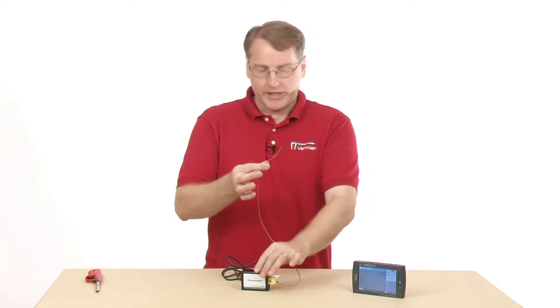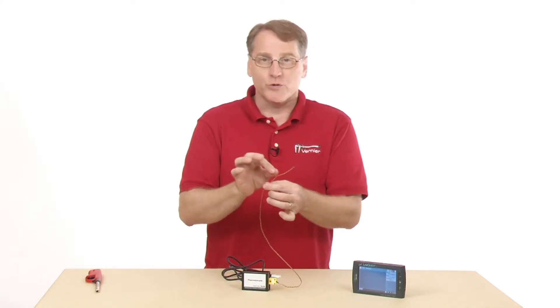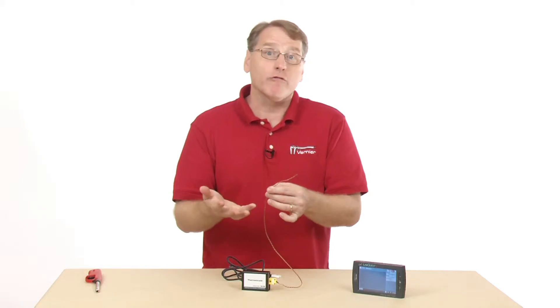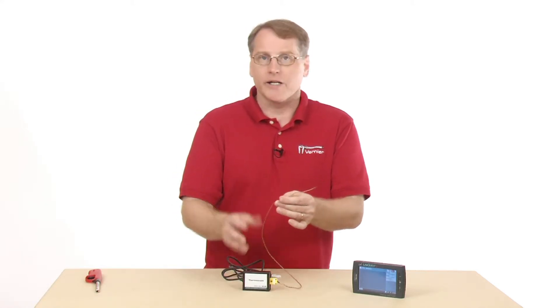This one actually has a built-in internal reference. Some thermocouples, you actually have two wires and you have to put one in a reference temperature. This one has a built-in ice reference inside it, so you don't need that.